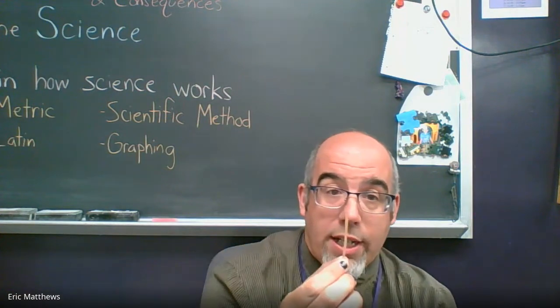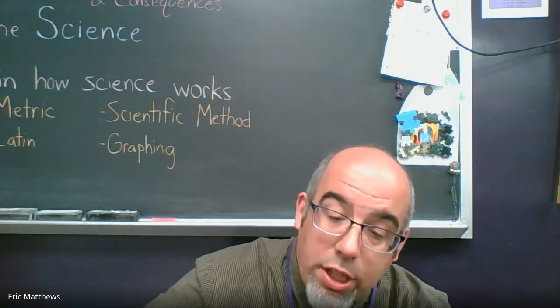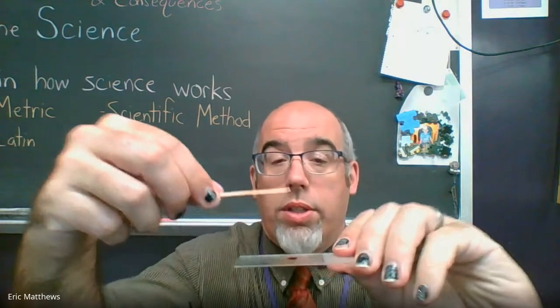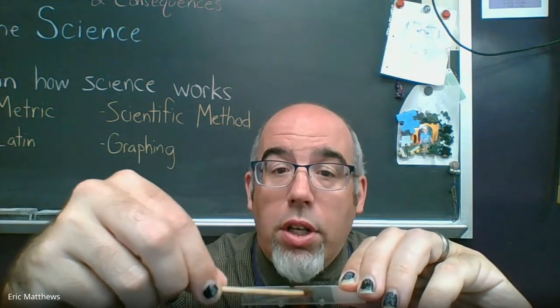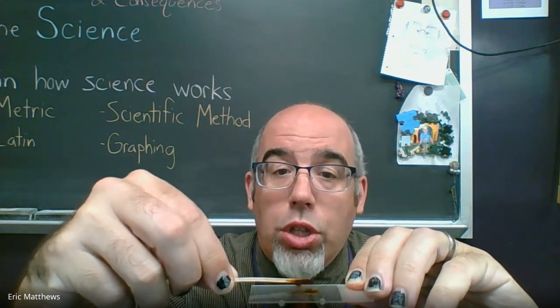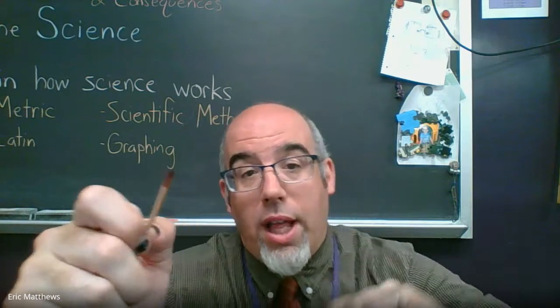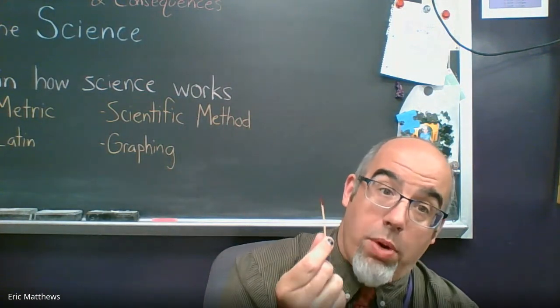Then you're going to take the end that you just swished around on the inside of your cheek, and you're just going to kind of stir it around on the iodine. So I'll hold it up so that everybody can see. Just stir it around. You just want to make sure that you get those cells that you just loosened from your own mouth onto the glass. This is now garbage. Make sure it finds the right place.